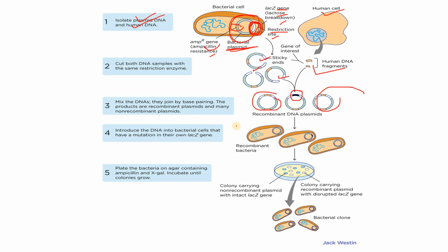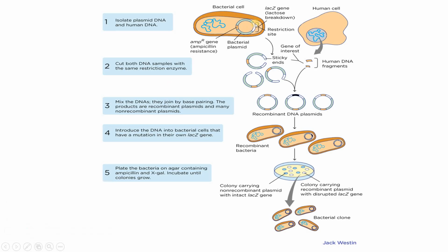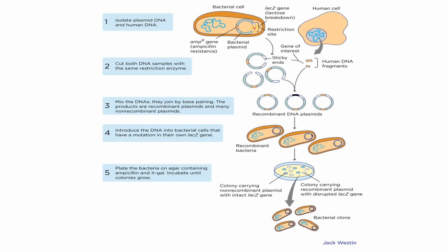Now, let's say the site got disrupted here. That means the lacZ gene will not be fully functional.